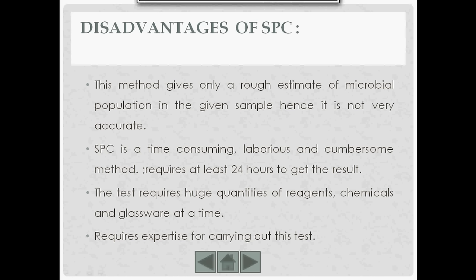This is a very time consuming, laborious and cumbersome method which requires at least 24 hours. This test requires huge quantities of reagents, chemicals and glassware for performing at a single time. And finally, the most important thing is that the person who is carrying out this test should be an expert. Otherwise, the results that we get will not be proper.